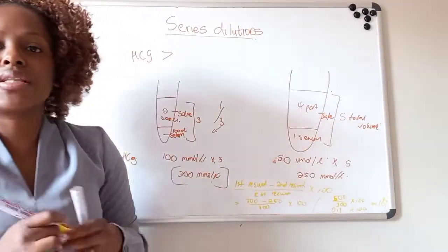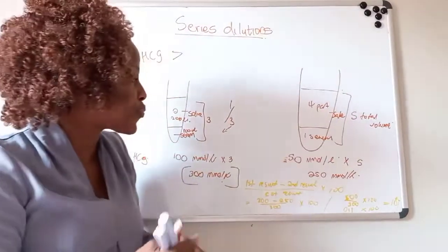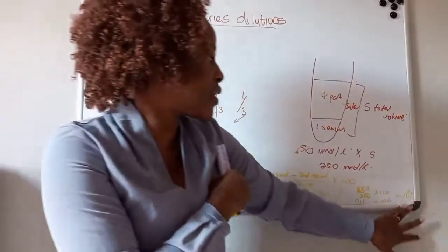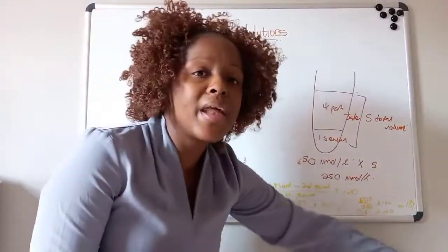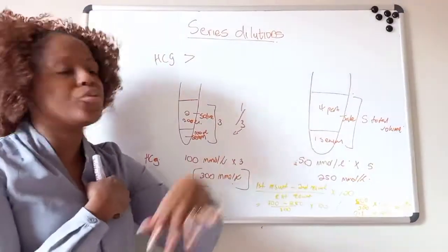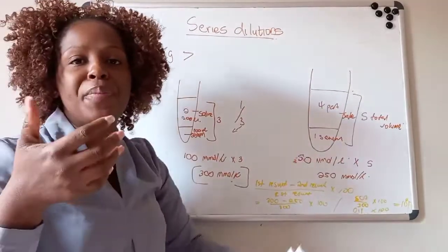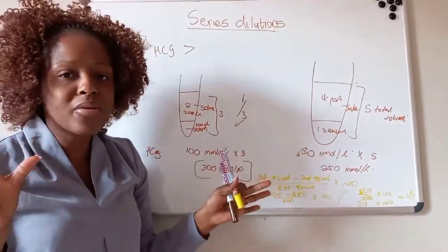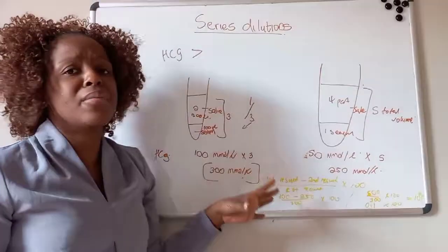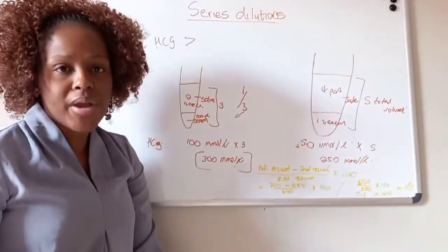Then after you've gotten the difference of 10%, like I said, you will check the allowable error for this analyte specifically. So if this 10% is within the allowable error, it means you can accept the result. But if it's not within, then you will need to do other dilutions. It might have been that when you were pipetting, an error happened there, or with the mixing and so on. And then after that, you will report the correct result.